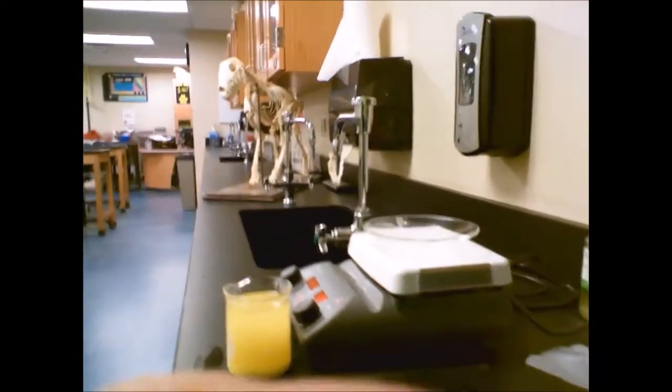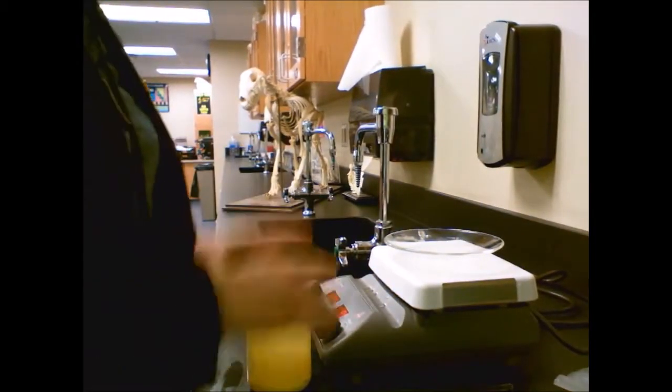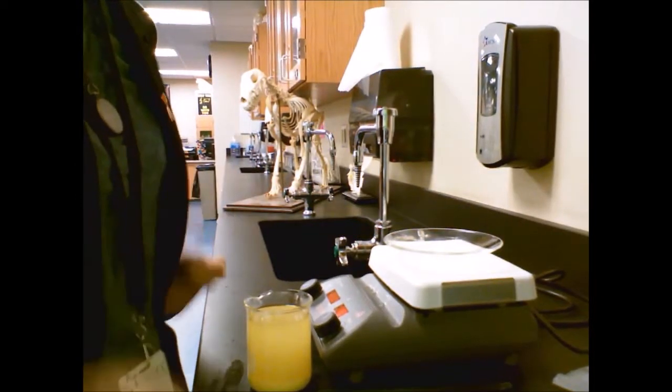Let me pop this off the stand. And looking down through here, these are the 2 largest crystals I have grown that I have found. Very small, seeing as this is on times 10 magnification. Probably going to give you seasickness if I keep holding this. So let this sit, let the watch glass heat. We'll be back with you in a second.